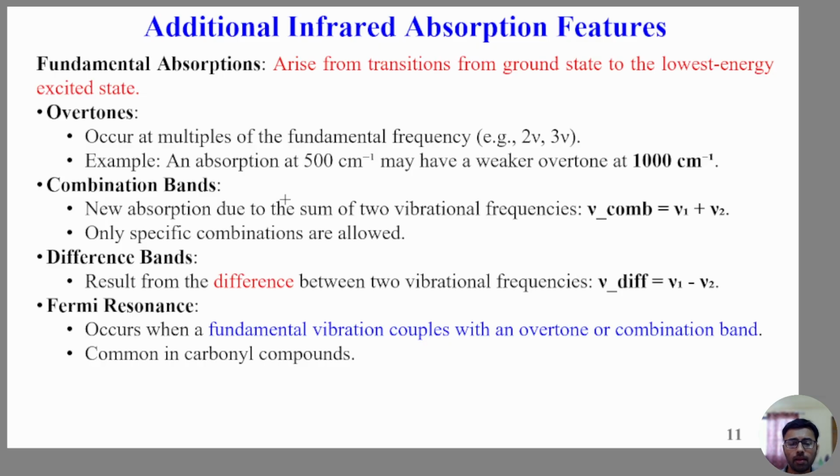Infrared spectroscopy may appear simple at first glance, but as we dig deeper, we discover layers of fascinating quantum mechanical behavior. The ability to recognize these patterns is what transforms someone from a beginner into an expert in spectral interpretation. In our next lecture, we will connect vibrational spectroscopy to classical physics. Specifically, we will use Hooke's law to understand how bond strength and atomic mass determine the frequency of molecular vibration.